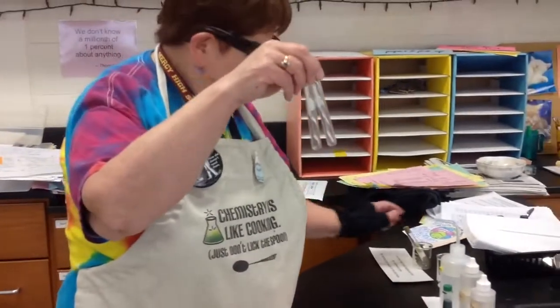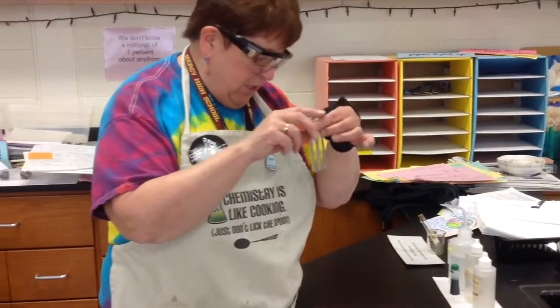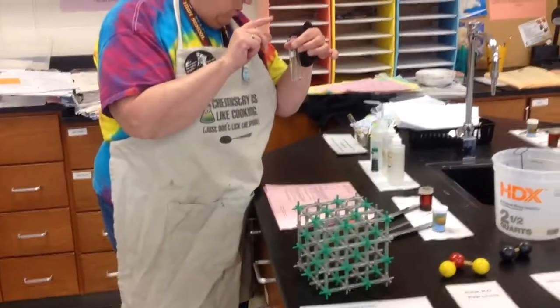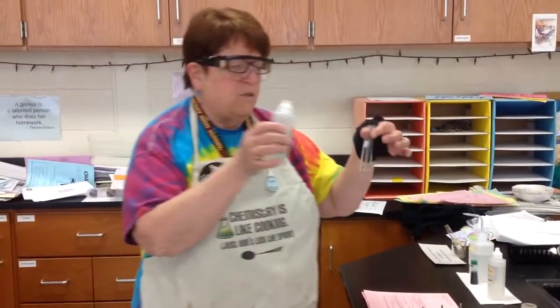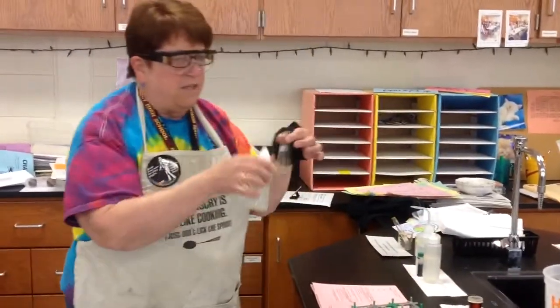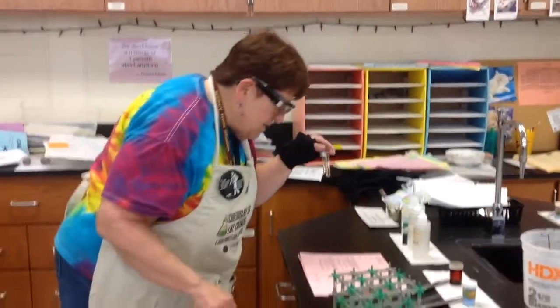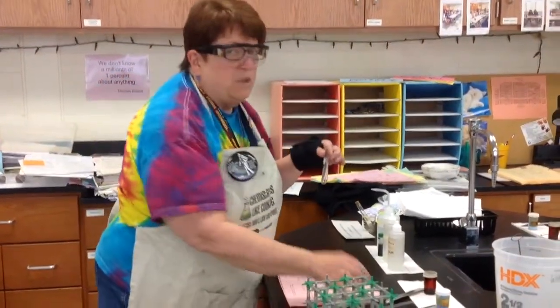And then you put some food coloring in, 1 drop in each. And then you will add hexane to one and ethanol to the other. Now this is where it says 3 milliliters of each. You really don't need to measure those 2 liquids carefully. In fact, we're running a little low on hexane, so just squirt a little hexane into one of them and squirt a little ethanol into the other. And then I believe it says stir with the stirring rod and see which one mixes and which one doesn't.